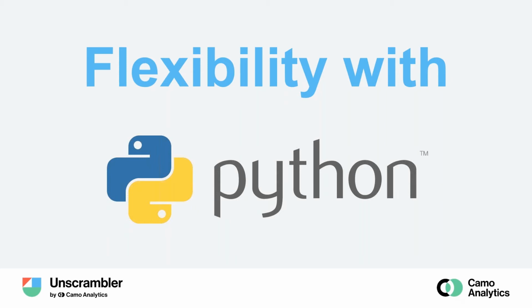This means that there are literally thousands of scripts available for you to download and use. With Unscrambler, you don't have to know much of Python in order to do this. You just have to fit the readily available scripts into the framework of Unscrambler, and then you can click run and you're ready to go.